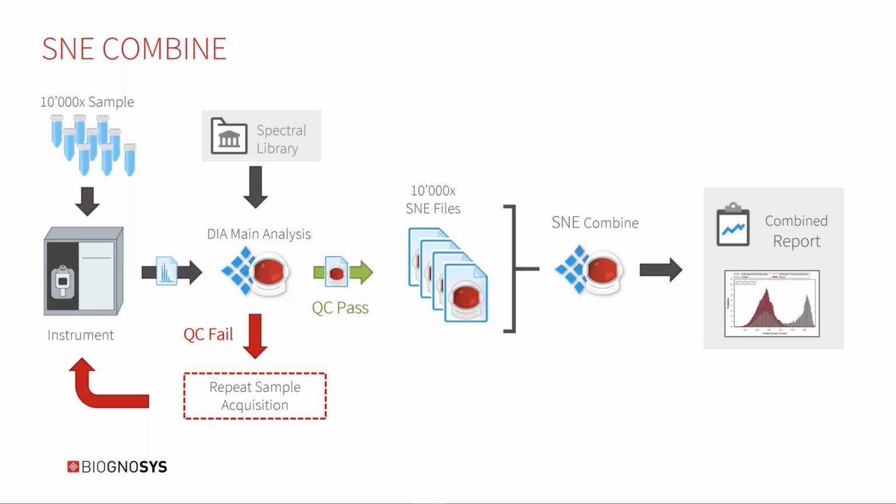And the cool thing about this is you can do this entire setup on a computer with essentially 16 gigabytes of RAM should be sufficient. So a medium-sized laptop could do this kind of large-scale study with SNE combined in Spectronaut 14.